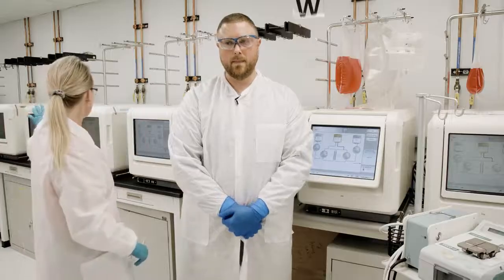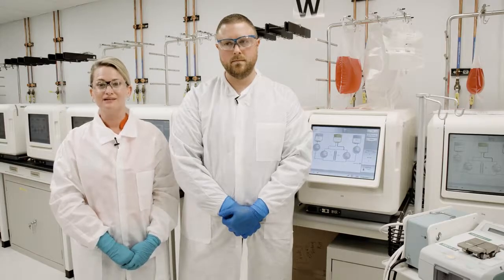Behind me, you'll be able to see a row of our quantum devices, and this is similar to the scale-out approach that our GMP customers are using today. The quantum system is an automated and functionally closed system designed to simplify the open, labor-intensive tasks associated with manual cell culture.